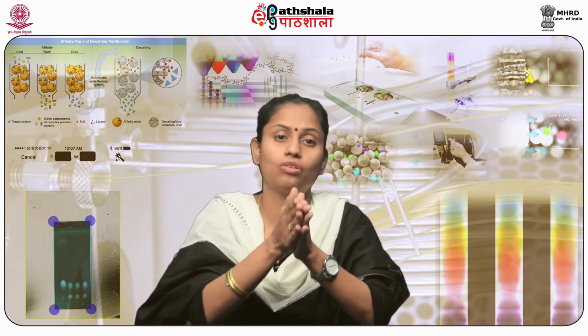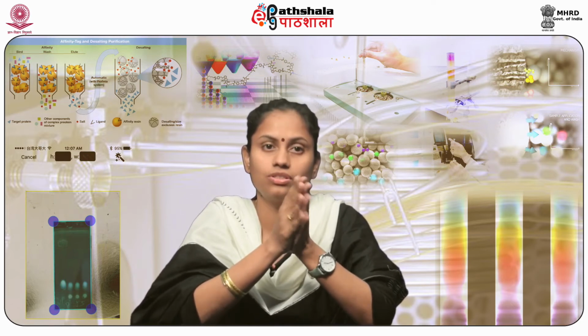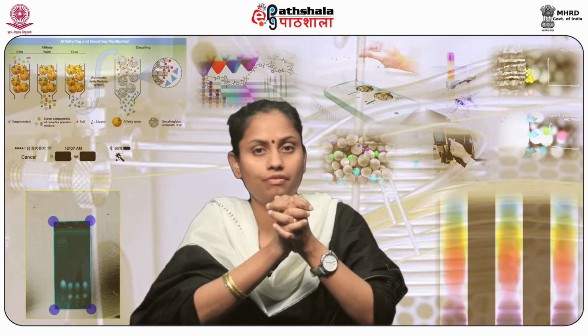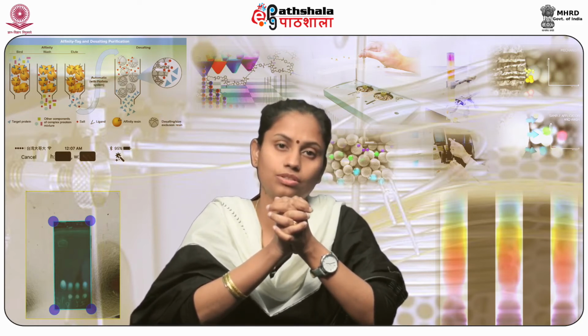Now, the size of resin beads and the cross-linking present on the resin affect the ion exchange efficiency. The flow rate of the mobile phase also affects the elution profile of compounds present in the mixture.